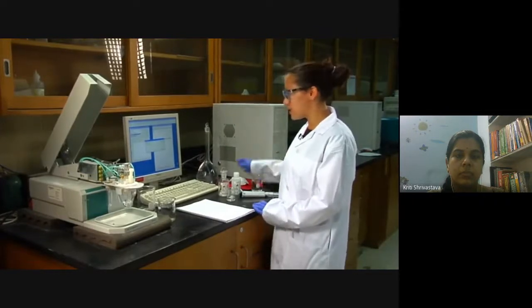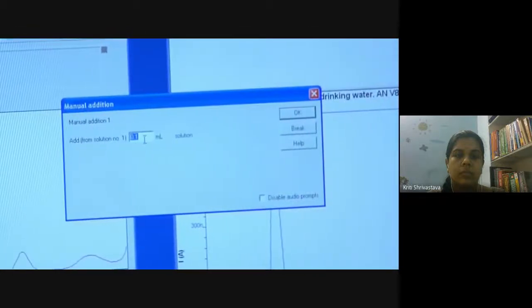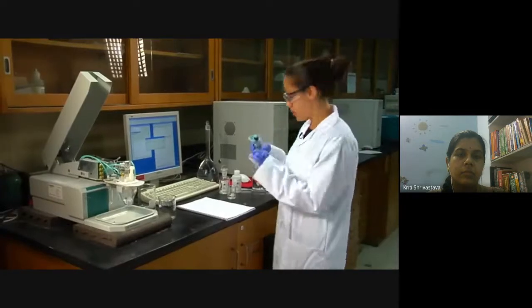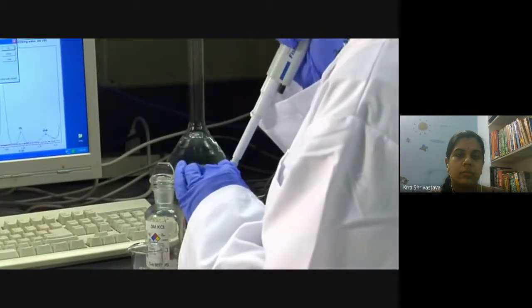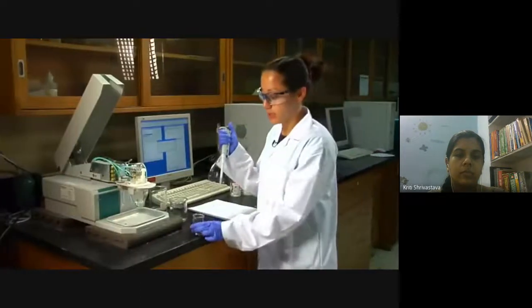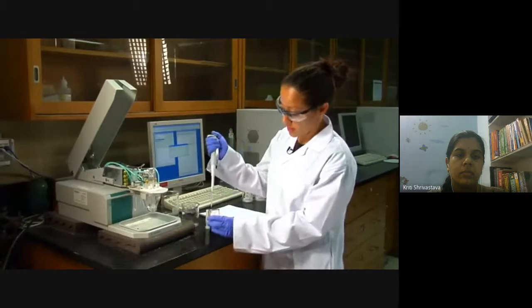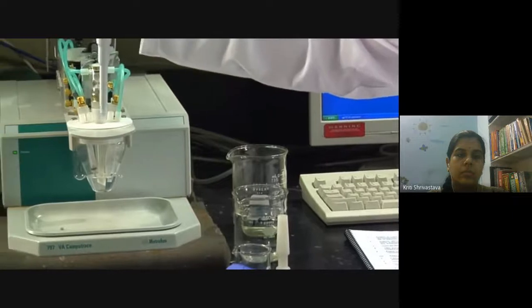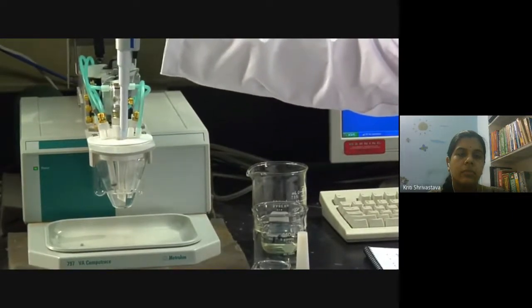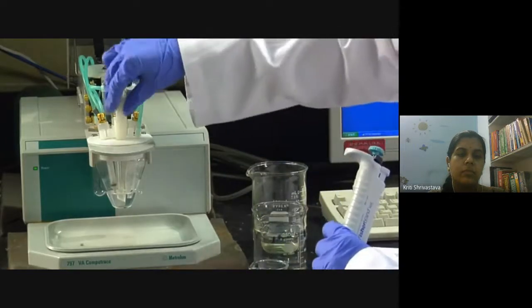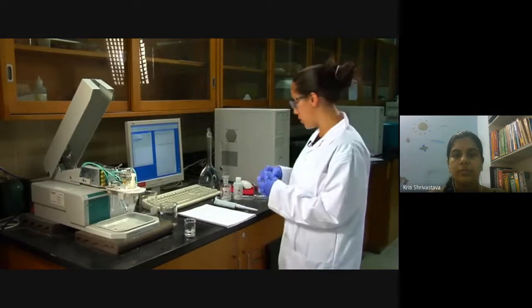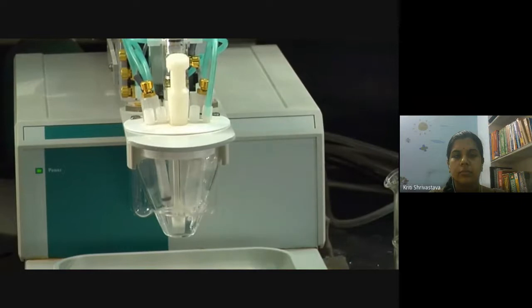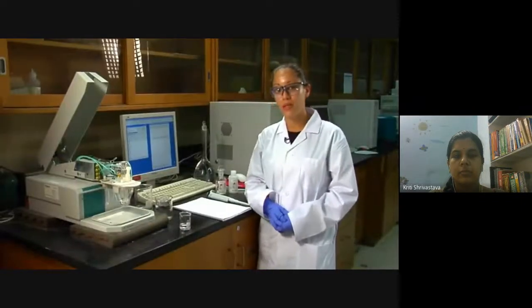Once you have your three measurements, a window pops up for the manual addition — the standard addition part. It reminds you to add 0.1 mL to your solution. Using the micropipette with a fresh tip, take 0.1 mL of the standard solution, remove the little plug on the cell, insert it just above the solution and dispense it, then put the plug back. That is your first addition. Click OK and it starts the purging process and deposition all over again. Repeat this procedure two more times — and that is the basics of performing a DP-ASV analysis.